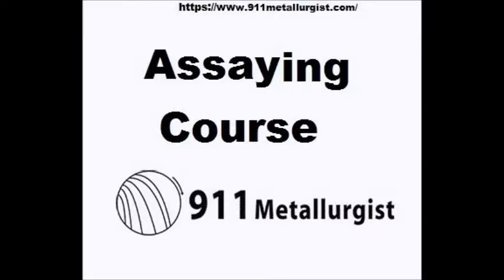If 0.5 gram of silver be cupelled with 20 grams of lead, there may be obtained a button of 0.495 gram. The absolute loss is 0.005 gram, and this equals 1% of the silver present. Similarly, cupelling 0.1 gram, the resulting button may be 0.098.